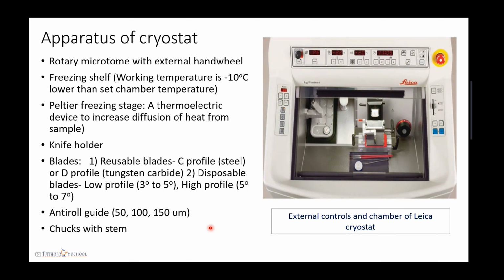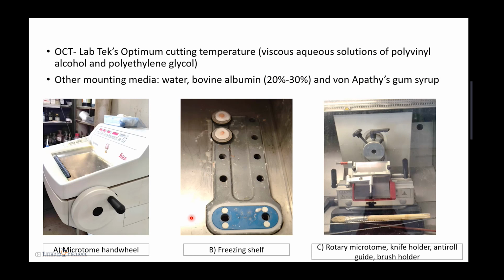Okay, so while taking the section, it should not roll up on itself, as it will cause folding. So to prevent that, we use this. They have installed this anti-roll guide in it. Okay, then there are chucks with stem. We'll see those chucks in later slides.